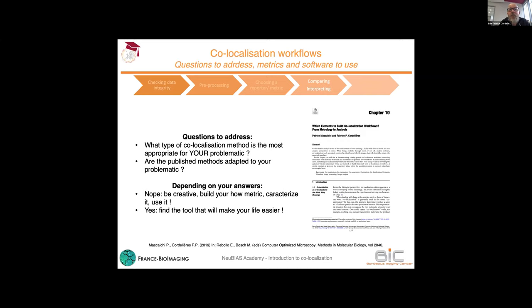So what question should you address? Knowing the metrics and the comparison and interpretation methods that I've been presenting, what type of co-localization method is the most appropriate for your problematic? Are you working on the intensities? Or are you working on physical coincidence? Are the published methods adapted to your problematic?